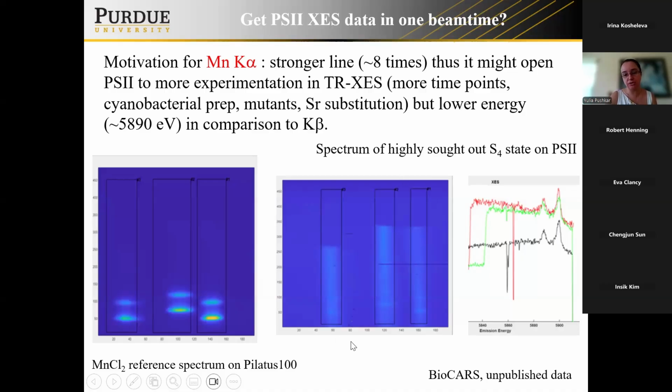This is how PS2 looks on the position sensitive detector. You might see a little bit of those peaks. This is how the processed data look. As you see, in a single beam time you already have very decent data quality. And for the final result, you combine those 3 crystals into one spectrum. Basically you can add up those 3 spectra, and the data are pretty good.